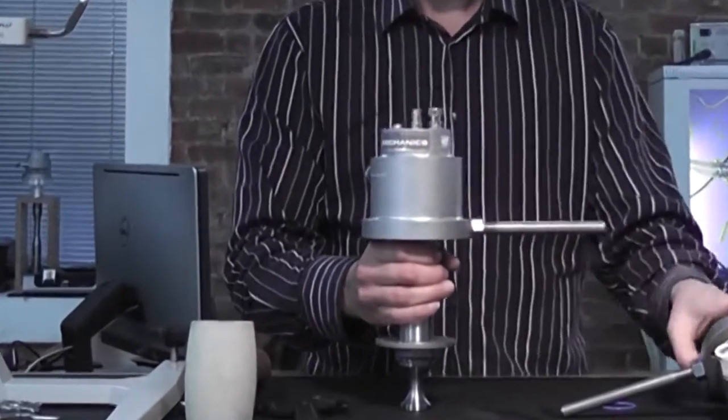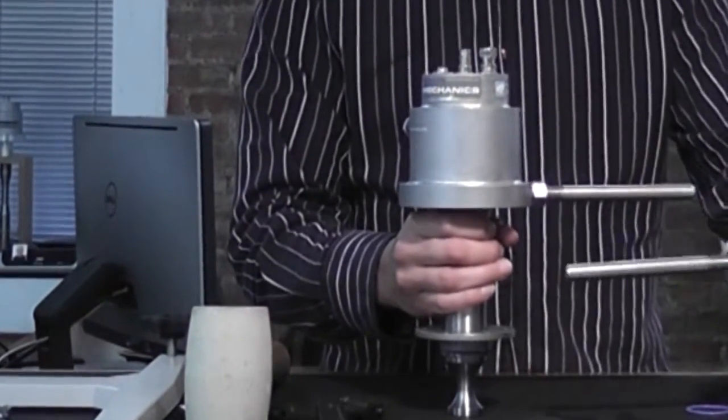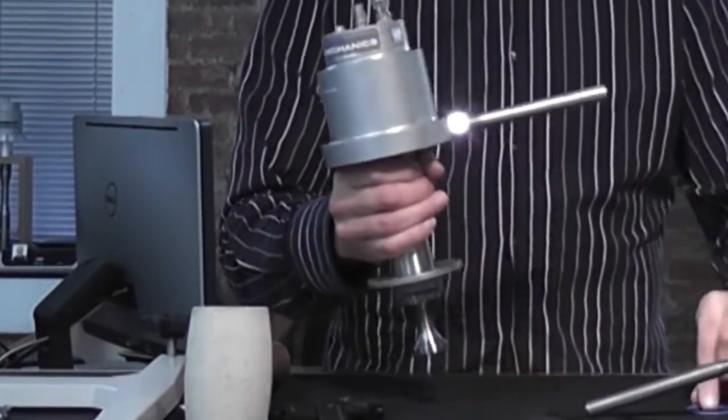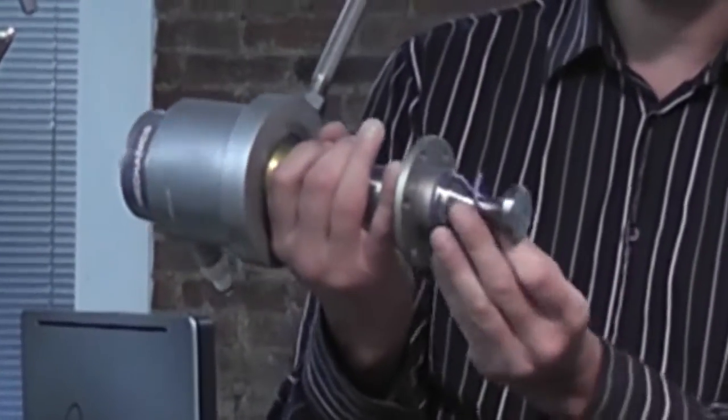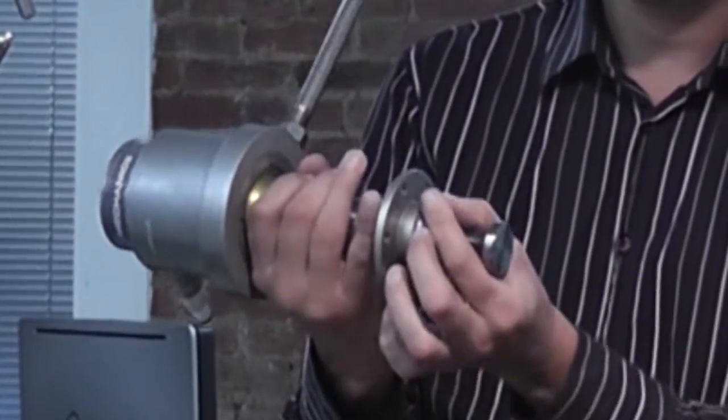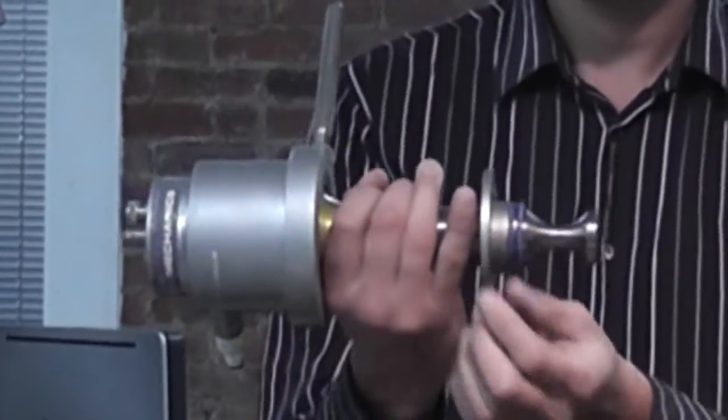Next, place the second O-ring below the flange of the horn.